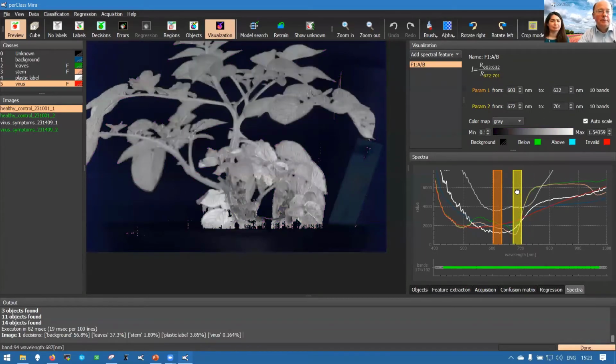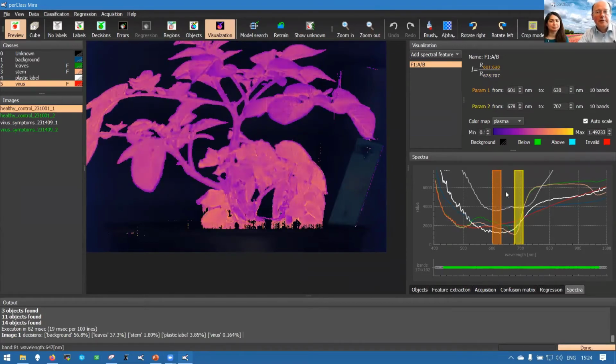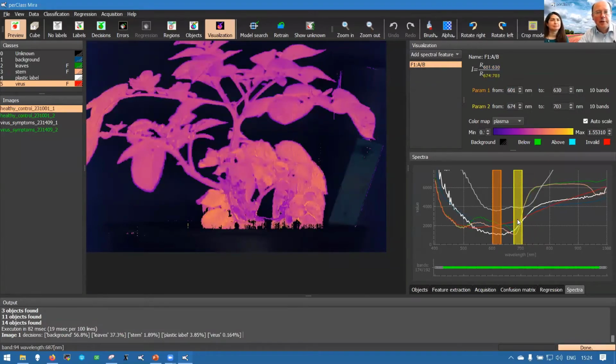That is very useful for spotting the differences by human eye or different type of color range. And here, basically, by playing interactively with the index, we can often spot things that are not really visible directly in the spectral data or any of the bands.